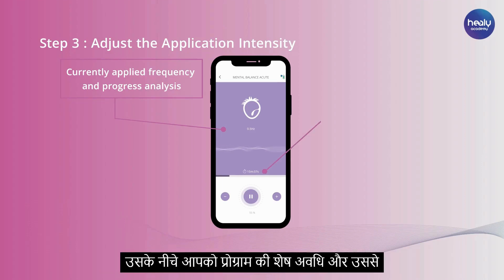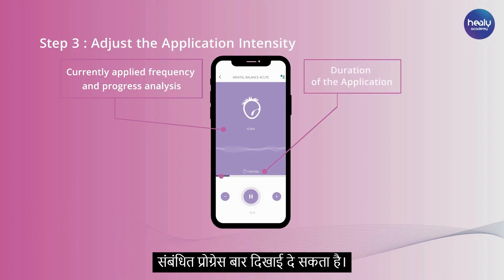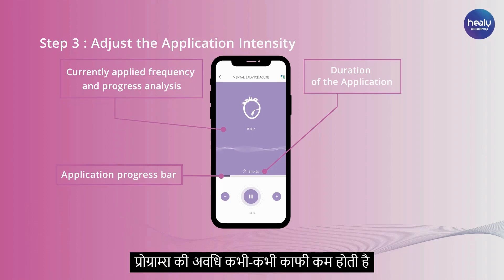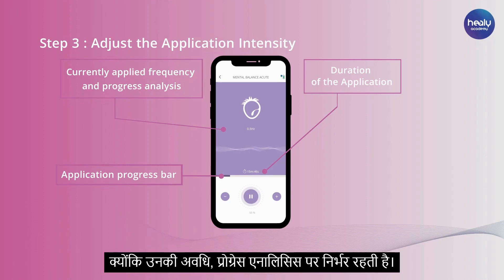Further down, you can see the remaining duration of the program and the corresponding progress bar. Please note that programs that use progress analysis can sometimes have a much shorter duration, as their duration depends on the progress analysis.